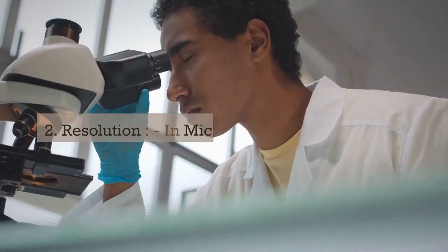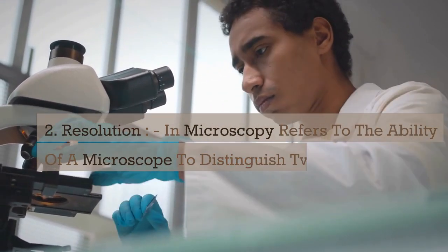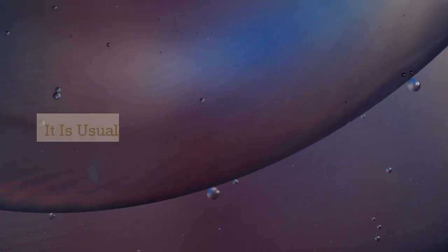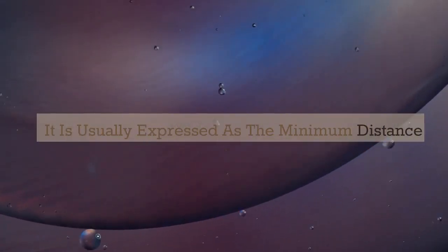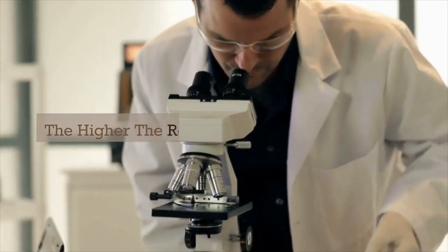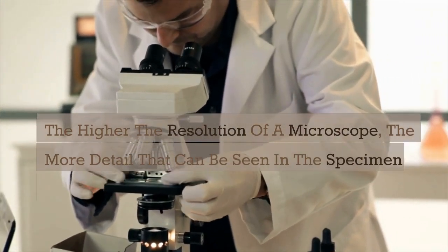2. Resolution. Resolution in microscopy refers to the ability of a microscope to distinguish two separate points as distinct and separate entities. It is usually expressed as the minimum distance between 2 points at which they can be seen as separate. The higher the resolution of a microscope, the more detail that can be seen in the specimen being viewed.